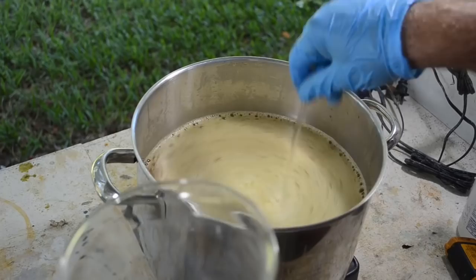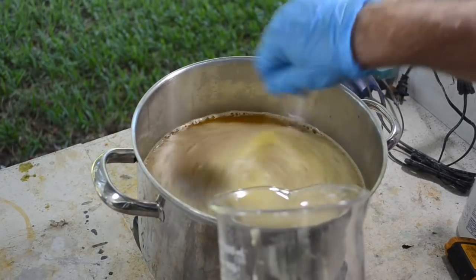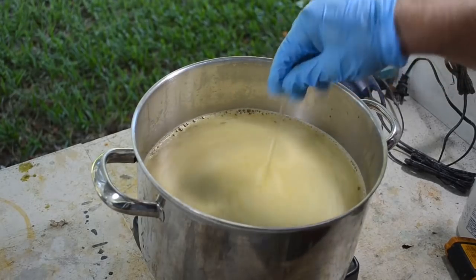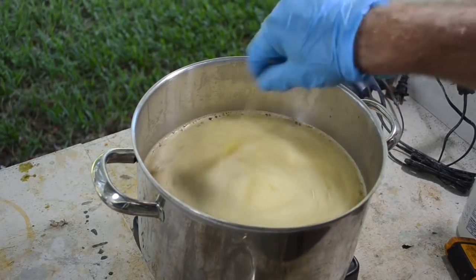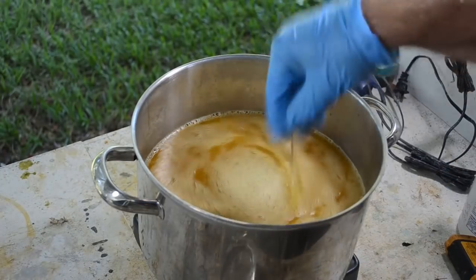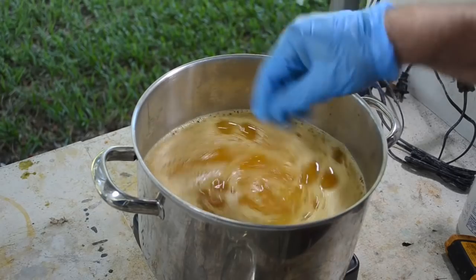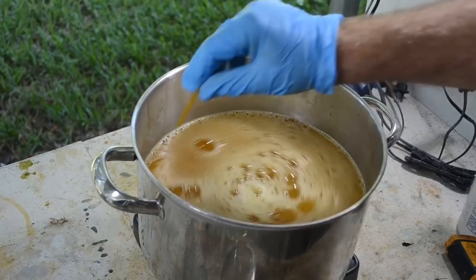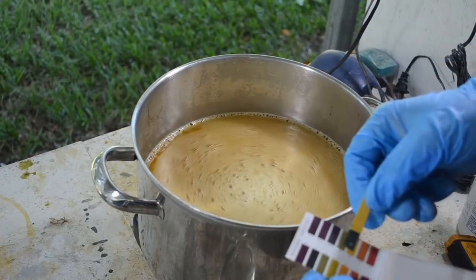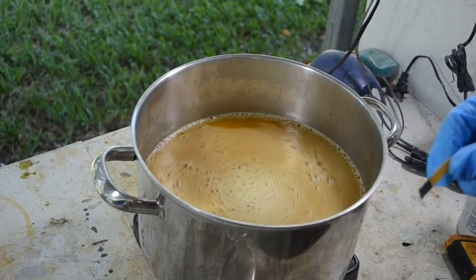So I have used not quite half of my acid. Let me put another shot in, and then we'll check the pH on it and see what we're doing here. All right, let the foam settle, get it good and stirred up, and we'll check the pH. Stir this around a little bit. All right, stick this in a place where there's some liquid and not the foam. Ah, now there's a change. Yeah, we're somewhere between 10 and 9, so that is not a big change. Not a big change yet.